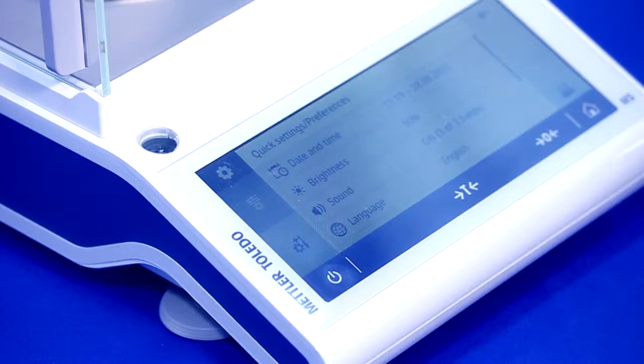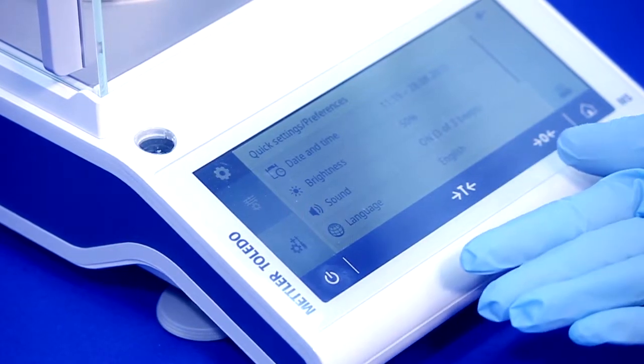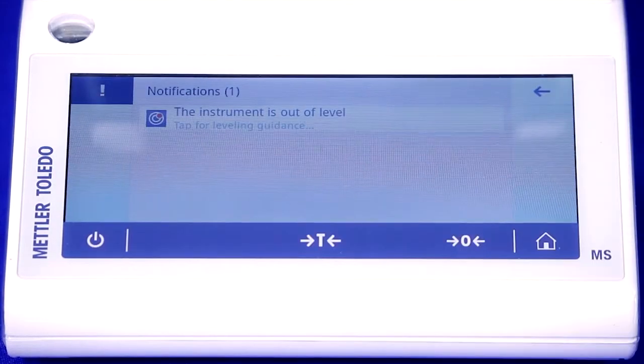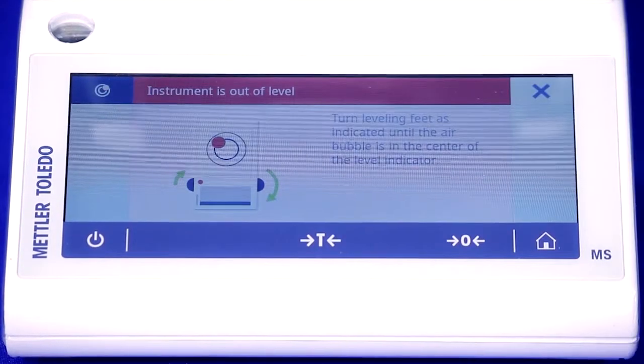There are several on-screen guidance features that allow any operator to get accurate results. For instance, if the balance falls out of level, level control notifies you immediately and guides you through the leveling process.